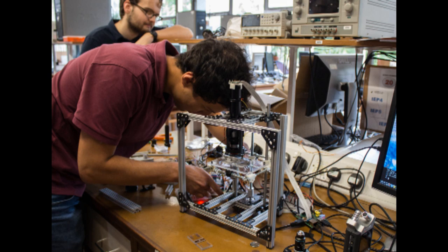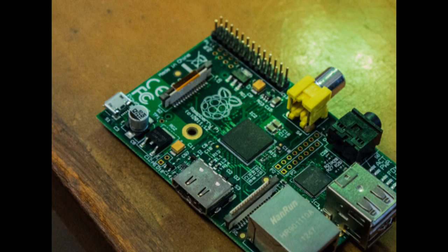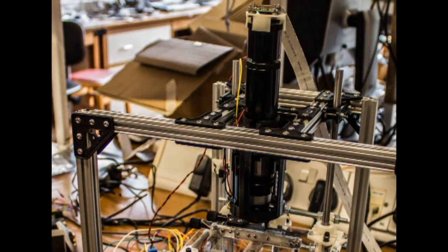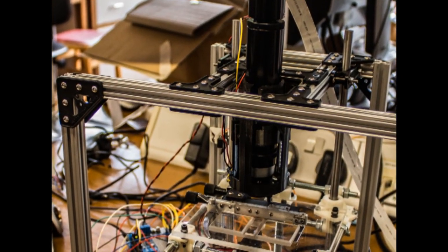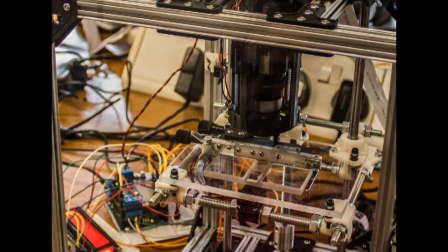They are building the prototype of a brand-new microscope using components already available on the market and a computer, the Raspberry Pi, that costs around $25. The final product will be an affordable, high-quality tool that will help research centers and education projects where resources are limited.